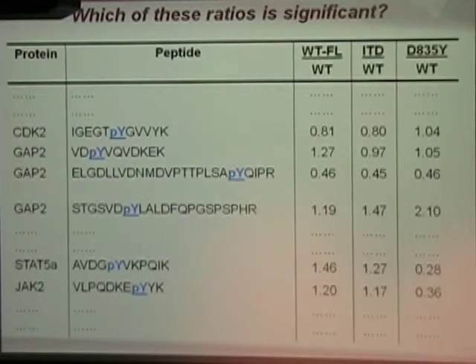But like I mentioned earlier, these peptides from the same protein are legitimately going in different directions in terms of their response to the signaling cascade, to the mutation status. So we need to develop an error model which will allow you to make some kind of statement about individual scans. So that's the quantitative challenge here, which I'm going to demonstrate first.